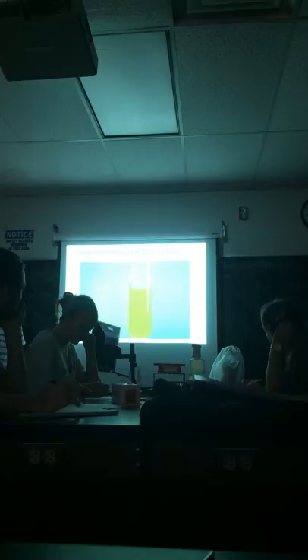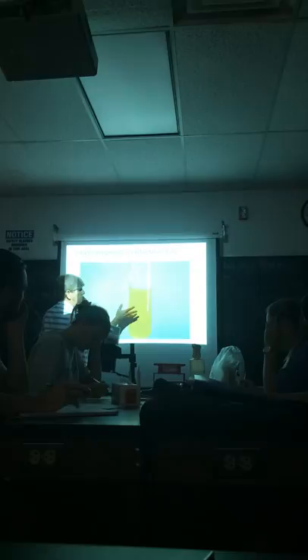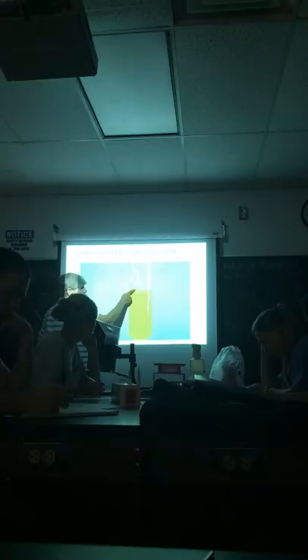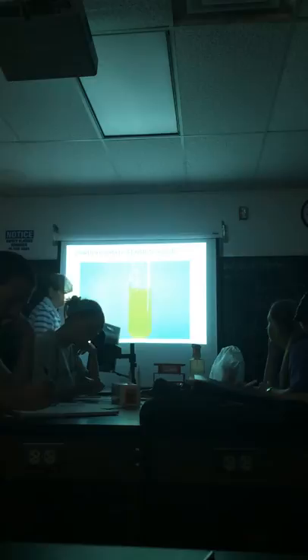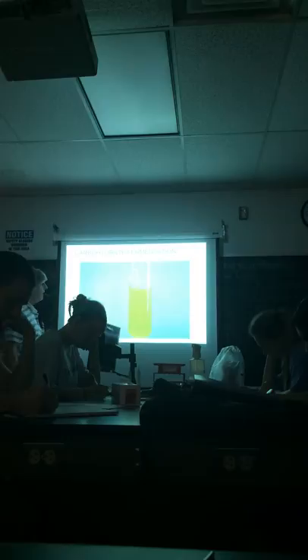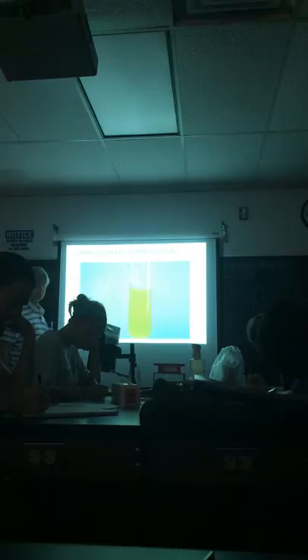When you see this yellow color of the broth, that means it is acidic. So, it has used that particular sugar and broken it down into acidic products. And then the tube on the interior right here, which is called the Durham tube, we tell whether it produces gas by whether we have a space right here, which represents a gas bubble in this case, or the liquid is all the way to the top.